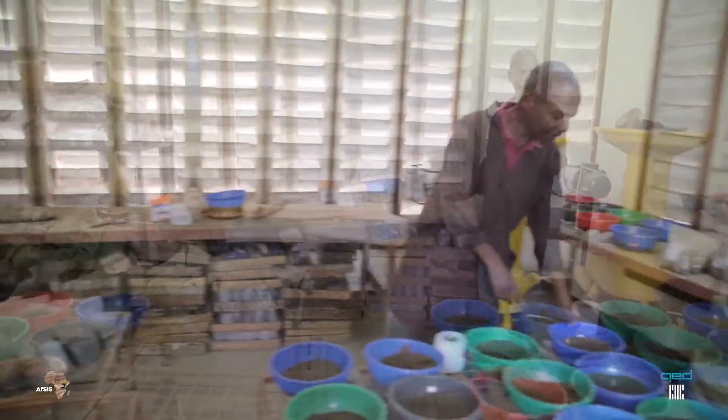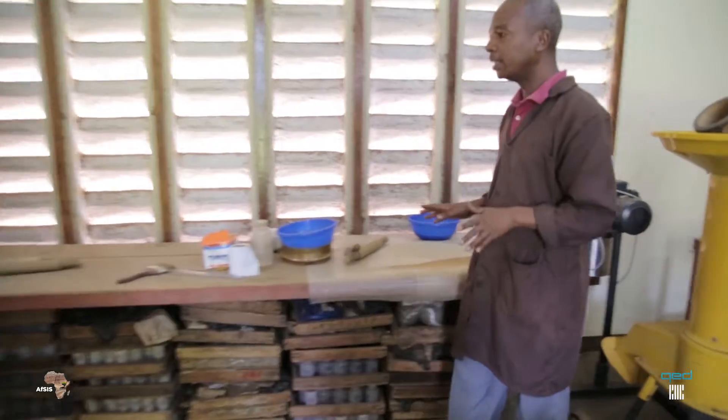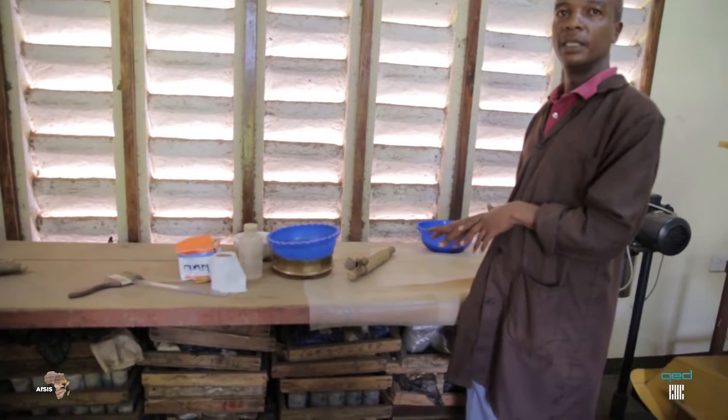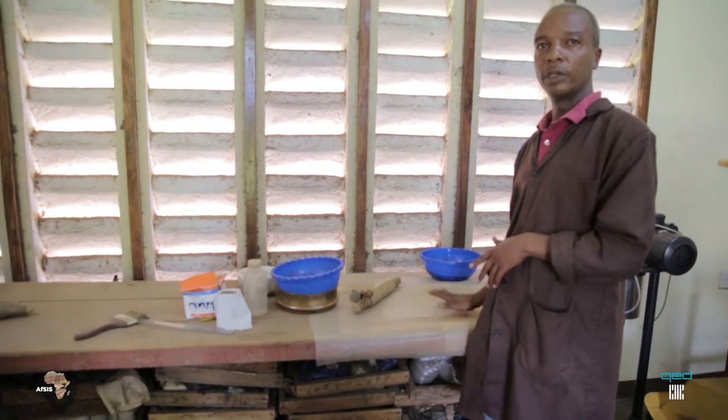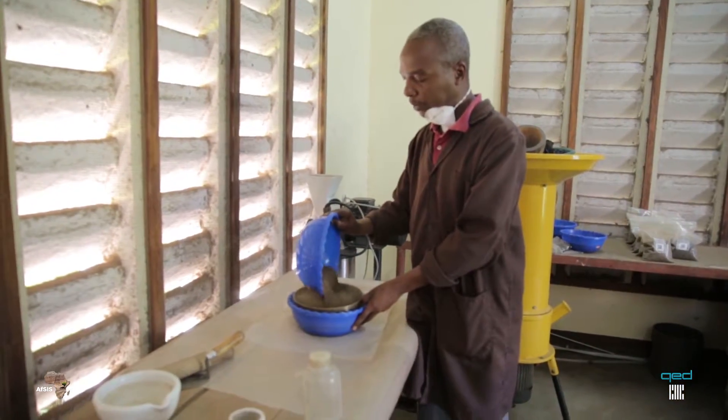Then after, you take the sample. You make sure that your table is very clean — there is no dust, and there is no any kind of sample nearby. This is the table on which you are going to process the soil. You put your sample on top of that sieve mesh.